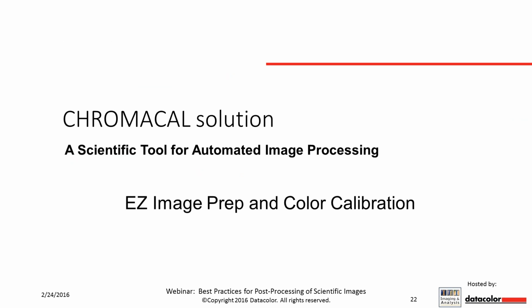So I'd always wondered, this isn't rocket science. There's only X number of things that you have to do in order to correct a color bright field image. And so I was really happy to hear about the solution from Data Color called ChromaCal. And I think what I'm most excited about is that the images are consistent, that it removes the variability from imaging. It takes so much less time, and it's just a slam dunk for batch processing.